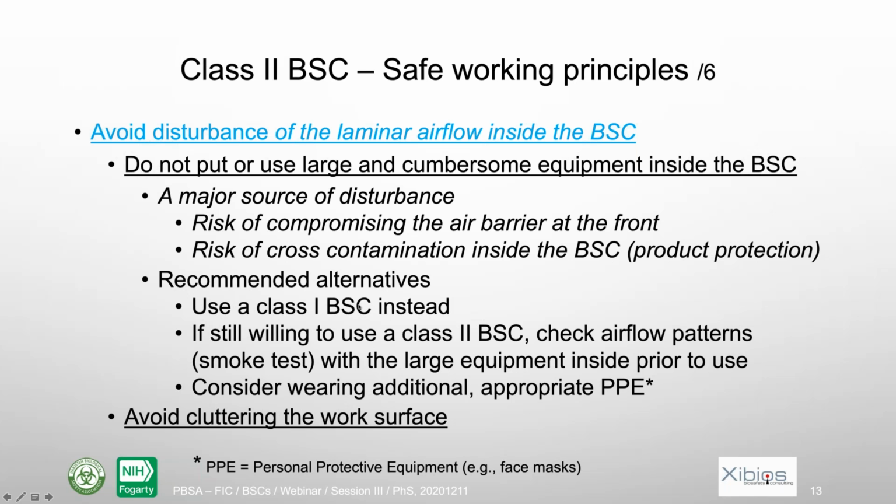With class 1, there is no laminar flow, so you won't disturb it, and the protection is much better. It takes the air away from you. So in that case, you will not be exposed.